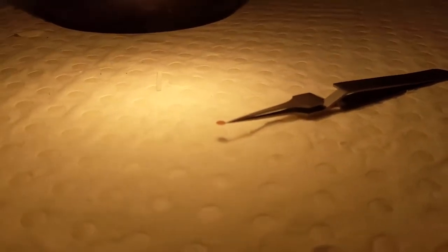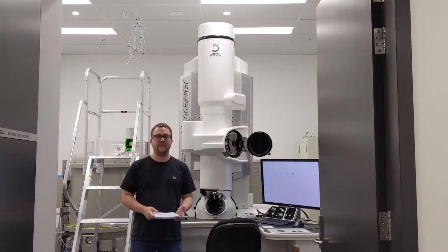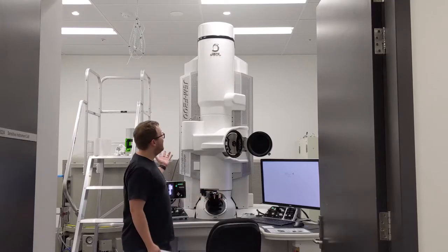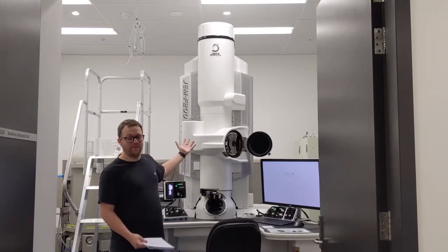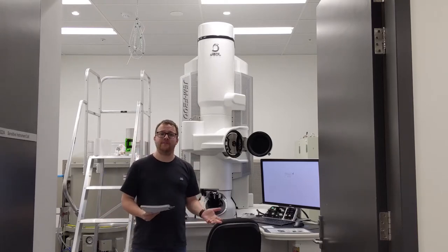Okay, so 1 hour has passed, and as we can see, the sample, which did have a droplet on it, is now completely dry, and this sample is now ready to go into the TEM. We are now standing in the microscope room, and here we have the electron microscope. It's about 2.5 meters tall and weighs about 2 tons.